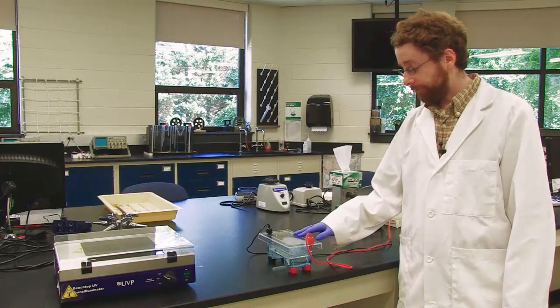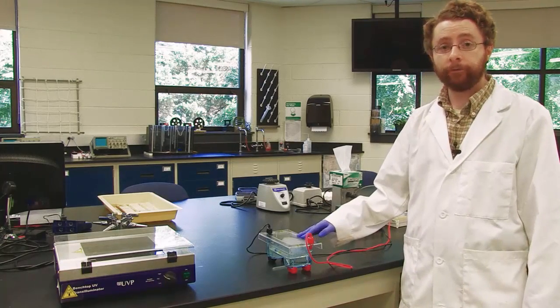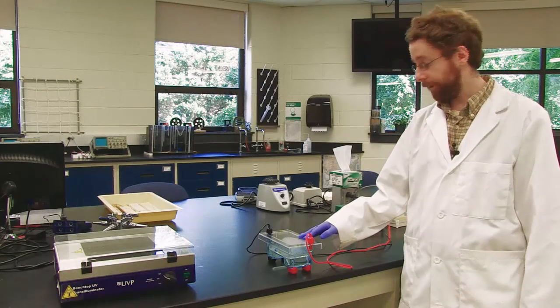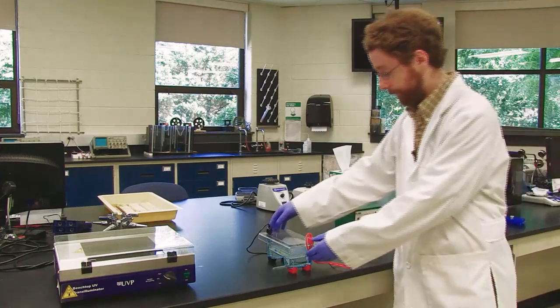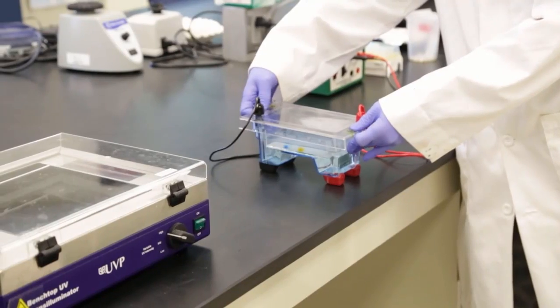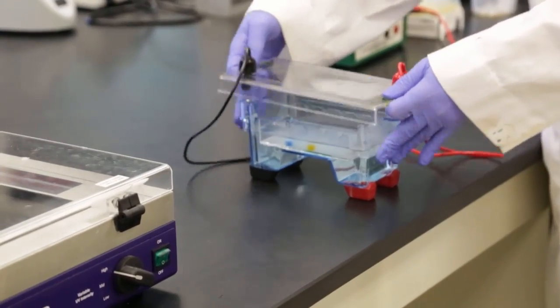Our gel has finished running. The loading dye has run at least halfway down the gel. So I'll turn off my power. And I will open up the gel box.